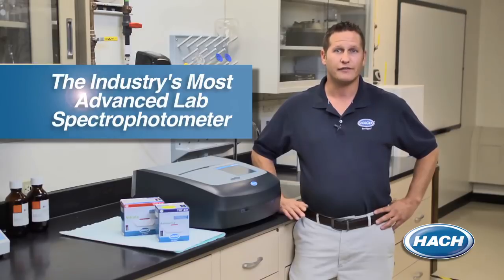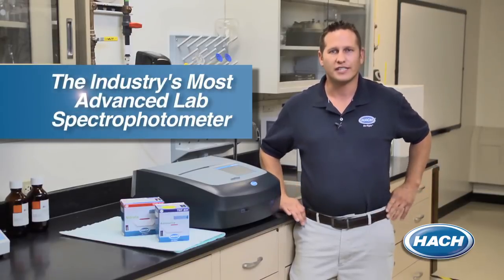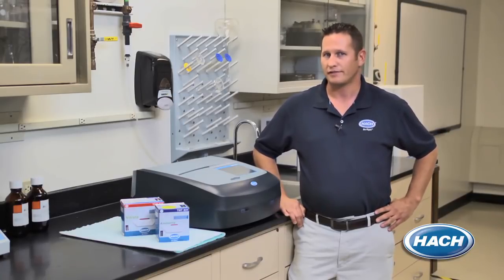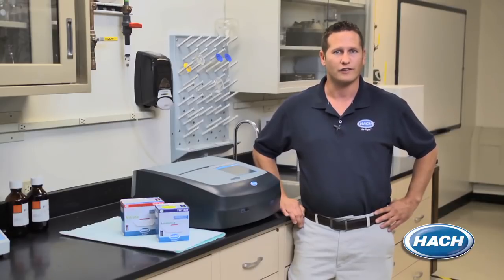Hawk has been the innovator in water quality testing for over 60 years and the leader when it comes to service and support. When using our DR6000 spectrophotometer, you can be sure that you are ready to handle your comprehensive water testing needs. Thank you for spending some time with us today and seeing why we consider our DR6000 the industry's most advanced lab spectrophotometer.